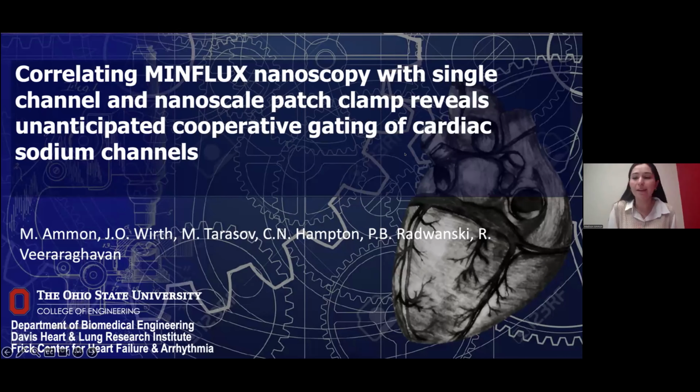Hi, everyone. Today I'll be presenting recent work from my group where we were able to correlate structural MINFLUX data with functional patch clamp results in order to further investigate cardiac sodium channel interactions.